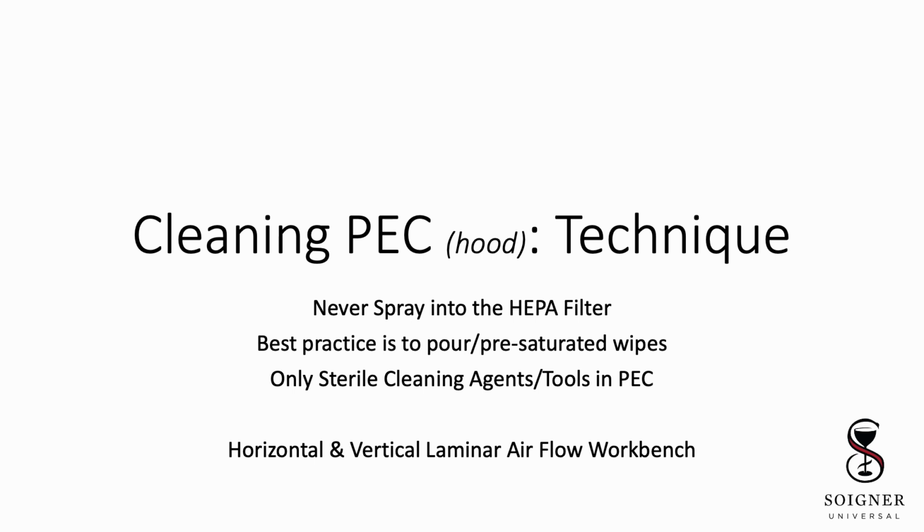Next up is the actual technique used to clean the interior of the PEC. This is going to be highly dependent on the airflow and the location of the HEPA filter. Some key items to remember during this portion of the presentation are to never spray directly into the HEPA filter. The best practice would be to pour a cleaning agent onto a wiper or use a pre-saturated wipe.